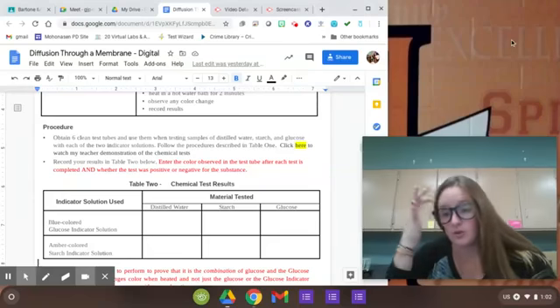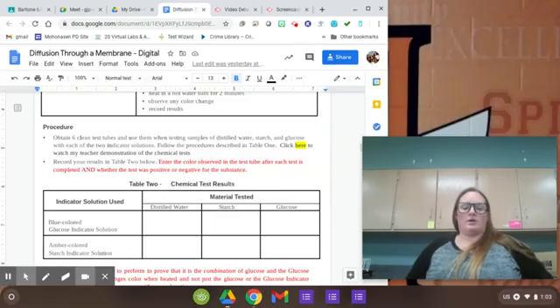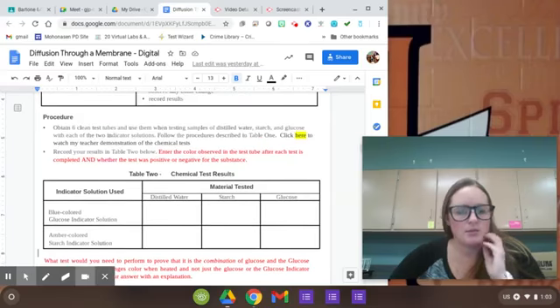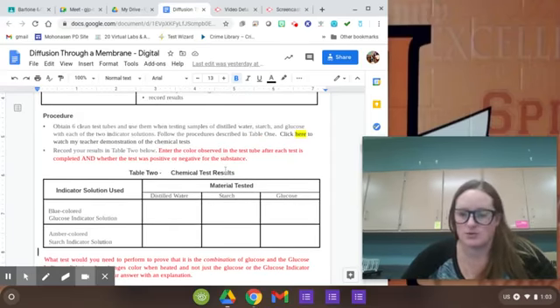Okay, friends. For this part of the lab, we're going to do it as a demonstration in class, but just in case you have missed it, you can watch this video. This part of the lab is table 2 on page 3, and it's asking about the chemical test results.